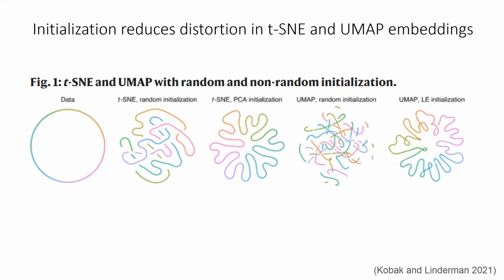Okay. All of this is to reinforce the point that visualization is an essential and useful tool for data exploration, but the coordinates of the data in 2D space cannot be used to infer how similar cells are to each other in the gene expression space.